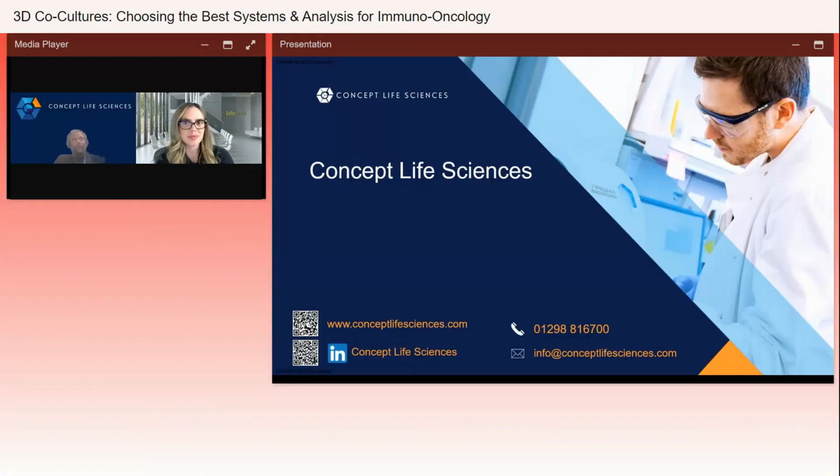So again, this is something we're starting to deal with again with iPSCs and how we start incorporating lots of different cell types together. Obviously, different cells have their own different needs. The one that we've done, so that liver fibrosis one, the nice thing there is it's MEM based. So actually, the thing we're having to add more of is the things that the stellates want. So actually using their media over the Hep G2 media has worked really nicely. The Hep G2s are quite happy.